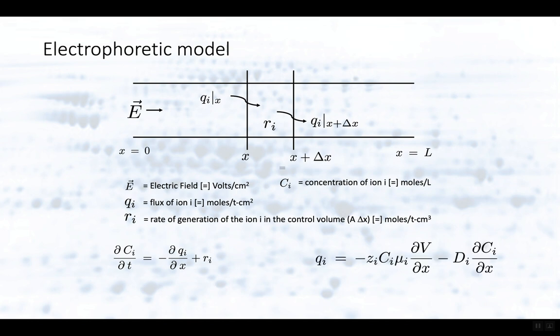Okay, now we have to describe that flux. Well, the flux actually has two components. If we have a concentration gradient, that's the second term over here. If we have a concentration gradient, there's a diffusivity that's associated with that. So we can get axial and radial diffusion of these components in the system. But there's another driving force, and that other driving force is the voltage gradient.